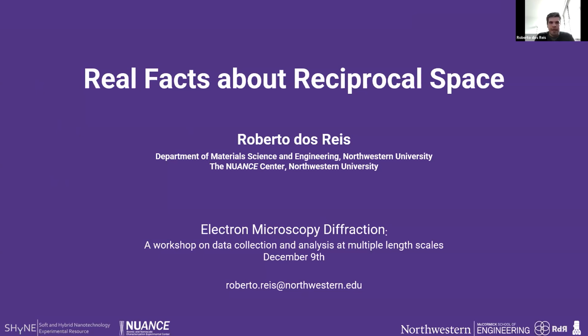So what I'm trying to do here in the next 30 minutes is just give a brief overview of using diffraction methods to explore the reciprocal space, right? Similarly to what Teresa did in the morning, I want to try to explain the basics of it, but of course also introduce newly developed methods and add what we do at Nuance as well.